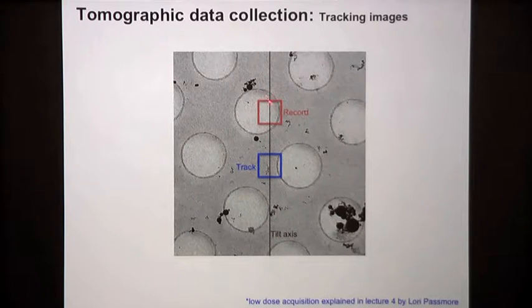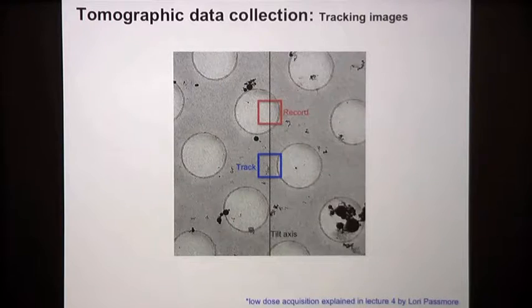To collect tilt series data, at this point, we would have to acquire many different additional images at a region which is slightly further away from our sample. For single particle analysis, this additional data was in the form of focus images, which would allow us to apply the correct defocus on the microscope.